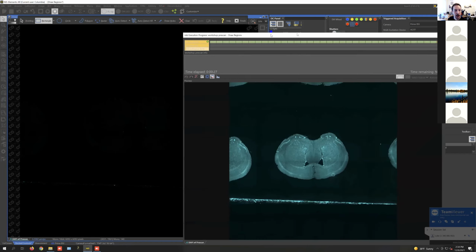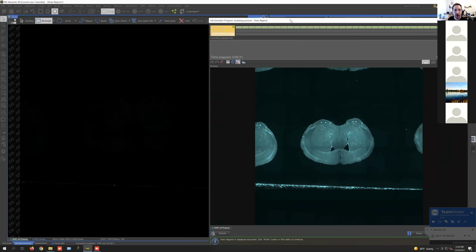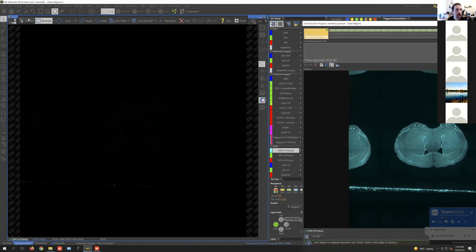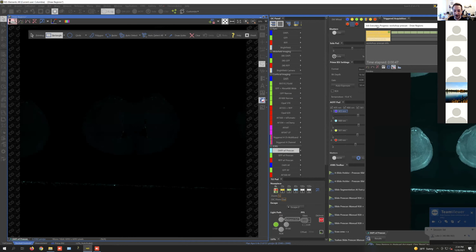And if I move this to the side, this can be a little bit awkward sometimes because this is the image that was captured. I can't see what's happening in it. I'm just going to move this to the side. Maybe I'll move this. I'm going to click auto scale. Okay, so if that's not working, let's just see.